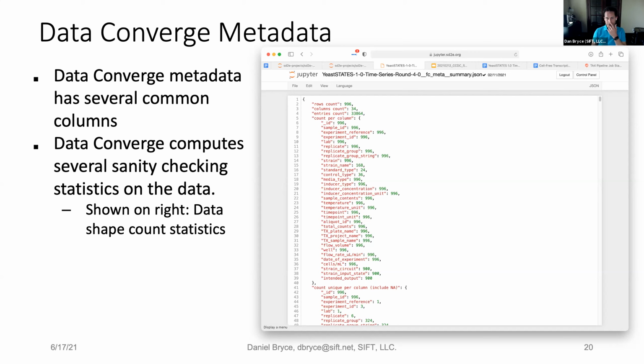So this has been a really helpful thing for us as we find things that should have been produced in the data frames but are hiding somewhere in our database, and we don't want to have to redo everything that we did up to that point. Because we're describing the data in this way, it's very easy to just push a button, bring that metadata through to the very end again, and rerun the analyses.